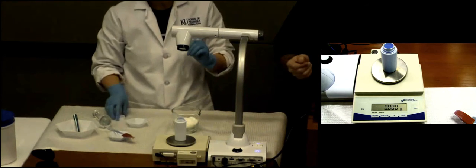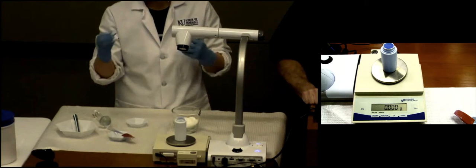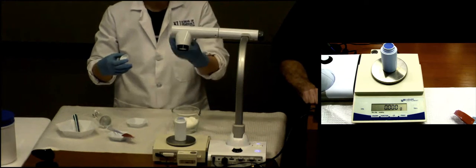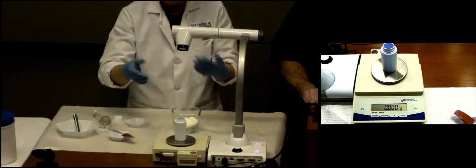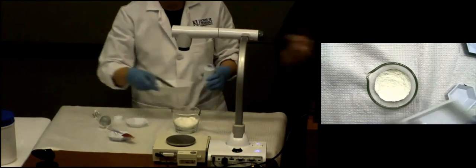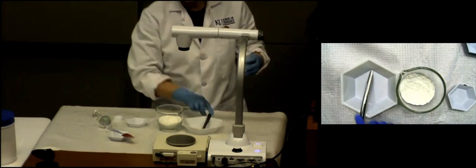And some students ask, does it matter? You tare with the lid on or without the lid? It doesn't really matter, as long as it's consistent. If you tare without the lid, you measure without the lid. If you tare with the lid, you measure with the lid. Does that make sense? All right, so I tare my bottle, and I'm going to show you the proper way of transferring first. And then I will do a little magic TV show.